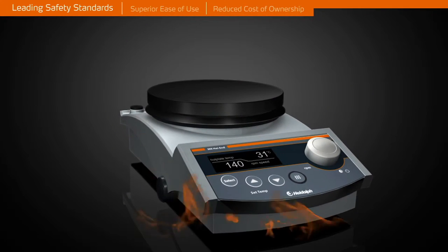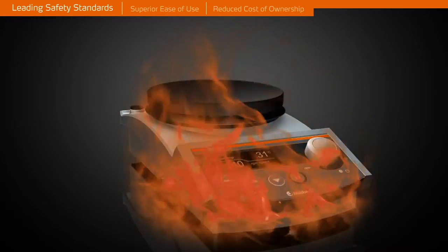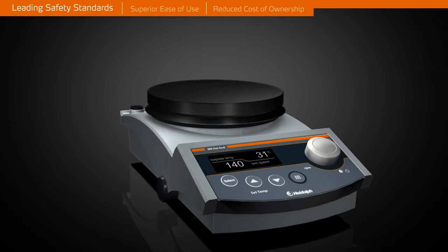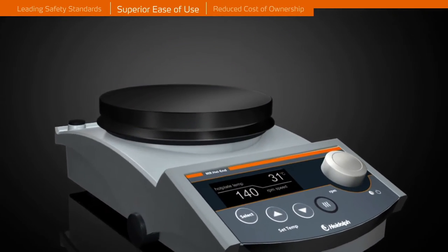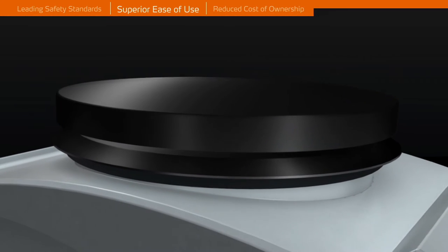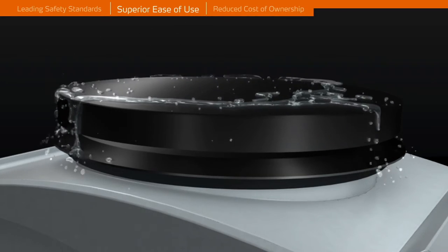Thermal damage to the stirrer is impossible. All models come with a fire-resistant aluminium die-cast housing. The aluminium top plate allows for immediate heat transfer for quick heat-up times, and a thin layer of ceramic coating makes the top plates chemically resistant and scratch-proof.